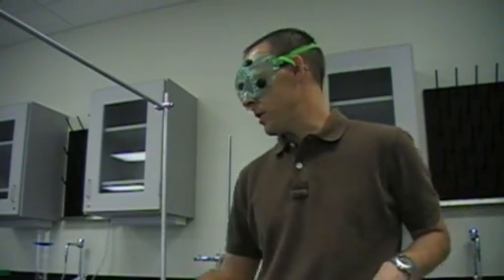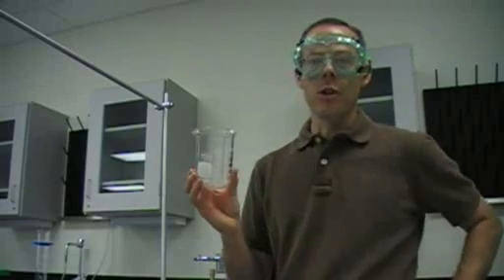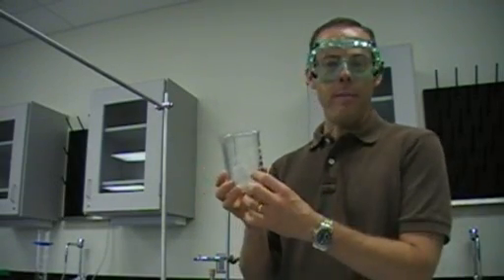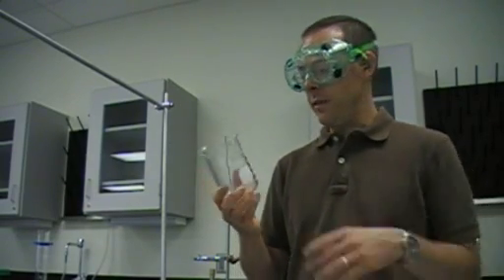There's various pieces of equipment that we're going to see in the lab this year. The first thing, which you're probably familiar with, is called a beaker. There's various sizes, as small as probably 25 milliliters up to 2 liters. The ones you'll typically see are 400 milliliter and 250 milliliter.